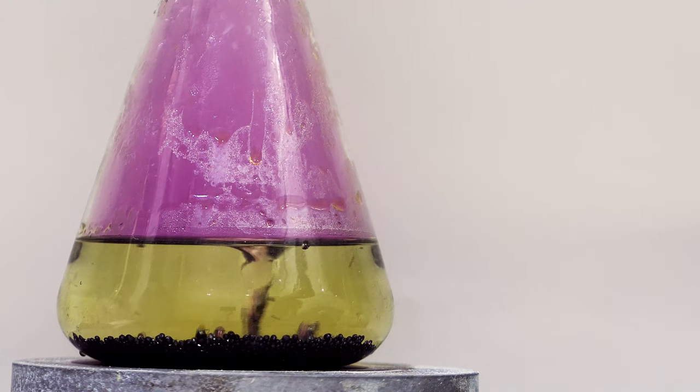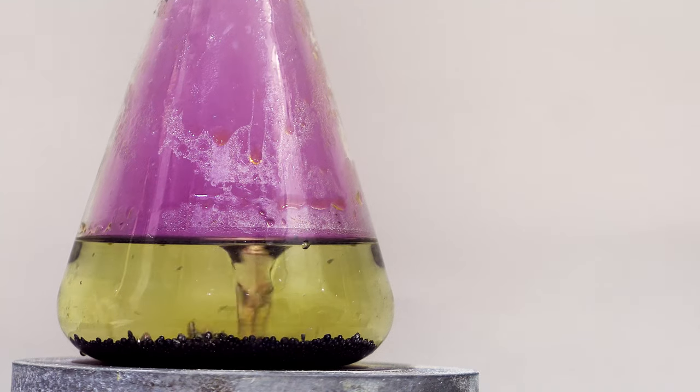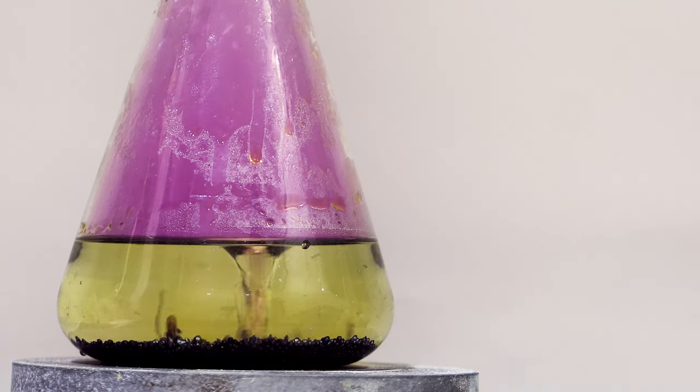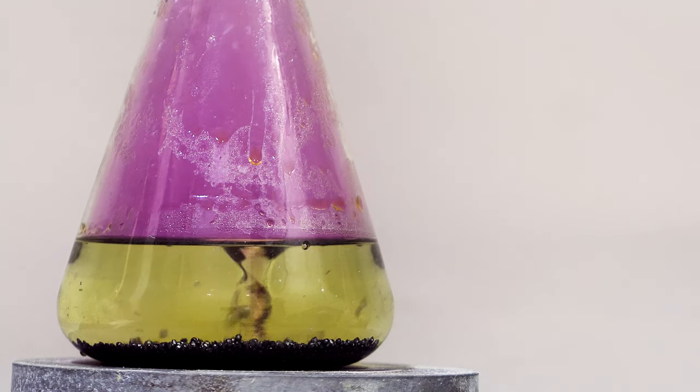First, dissolve 62 grams of potassium chlorate in roughly 200 milliliters of warm water. Then 1 milliliter of nitric acid is added using a pipette. After that, 72 grams of elemental iodine is poured into the reaction flask.